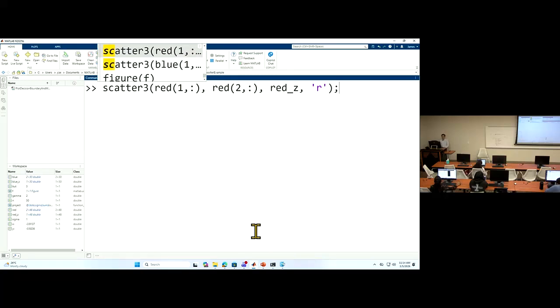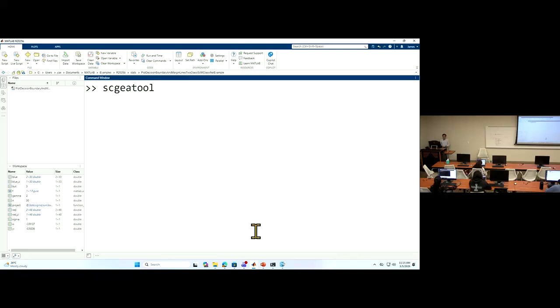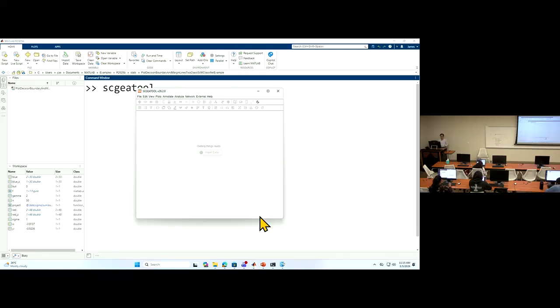I will see whether I can set it up easily from this toolbox here. I just need to know where I installed Python and point MATLAB to it, so it knows where to call Python.